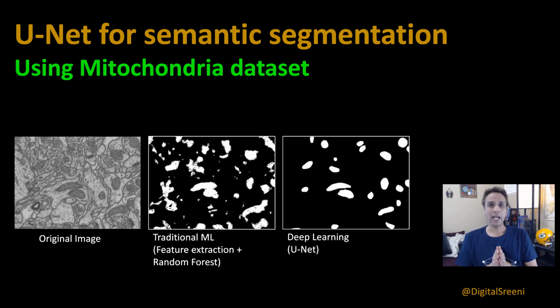Now, in fact, I have covered a series of videos on the topic of UNet. Go back to video number 73, 74, 75, and so on. So you'll get a bit more understanding of what UNets are. I did an almost in-depth review back in those videos. So here I'm going to mostly focus on the application and not dwell too much time talking about what UNets are. Although, if you haven't watched those, it does make sense for us to quickly have a look at what UNets are and then jump into the code.